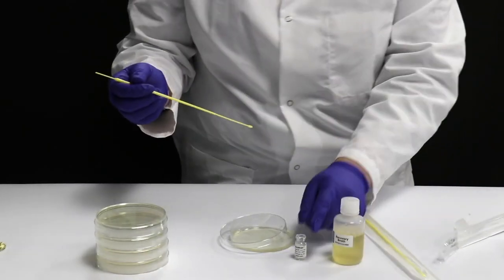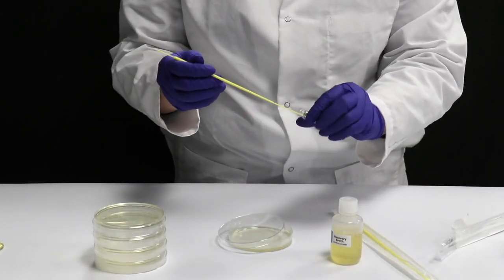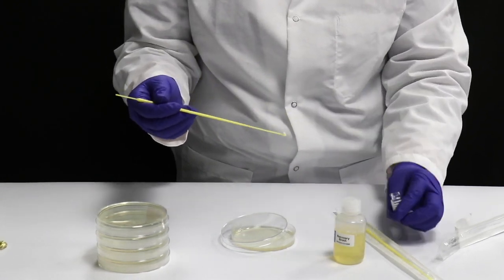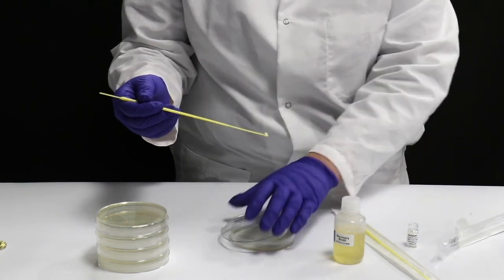Step 1: Preparation of Source Plates. Remove a single Bacto bead from the E. coli GFP host vial using a sterile inoculating loop and place the bead on top of the agar source plate near the edge.